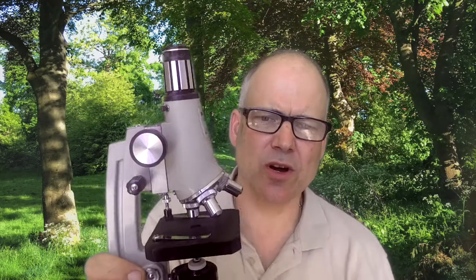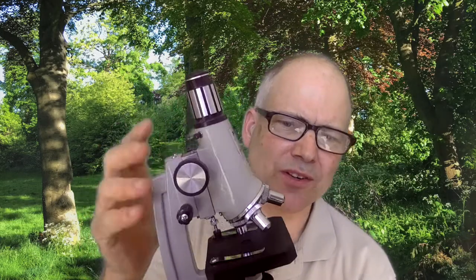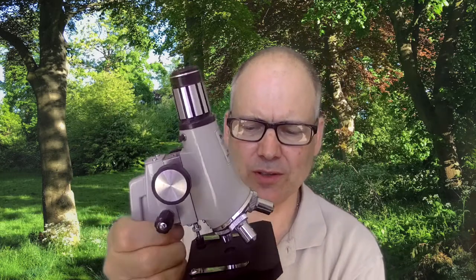Okay, so this is actually quite a nice microscope. It's one I had when I was a child, made by Prinz. So it's nice, metallic and robust. Now the problem is, of course, you're not going to be able to look down there very easily. And in fact, this one doesn't come with attachments to allow you to plug it into a computer. It's too old for that.